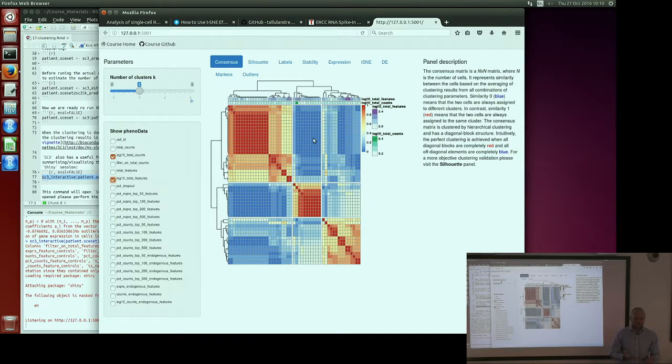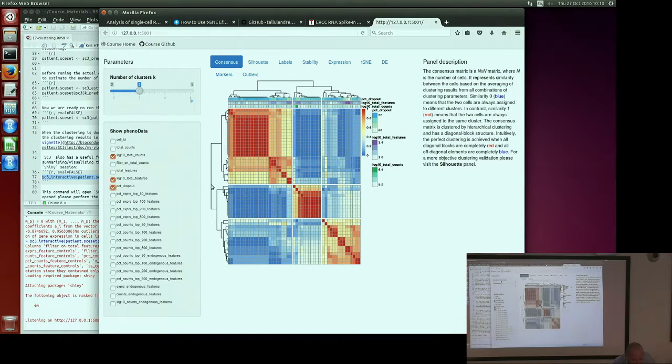I think it's just the percentage of dropouts in every row of your matrix, maybe averaged. I'm not sure. Davis probably knows the details more. But let's see how it looks. Do you reckon that here there are 3 clusters more than 4? Yes, we think so.